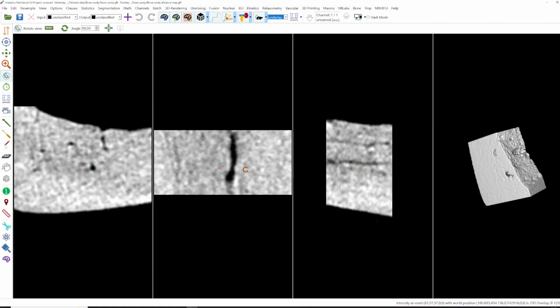So let's start by segmenting the cavity, and we can do this using thresholding and fill region operations. Let's pick a threshold that is suitable. You can find a threshold in the right corner, so here. Inside it's around 0 and outside 200.